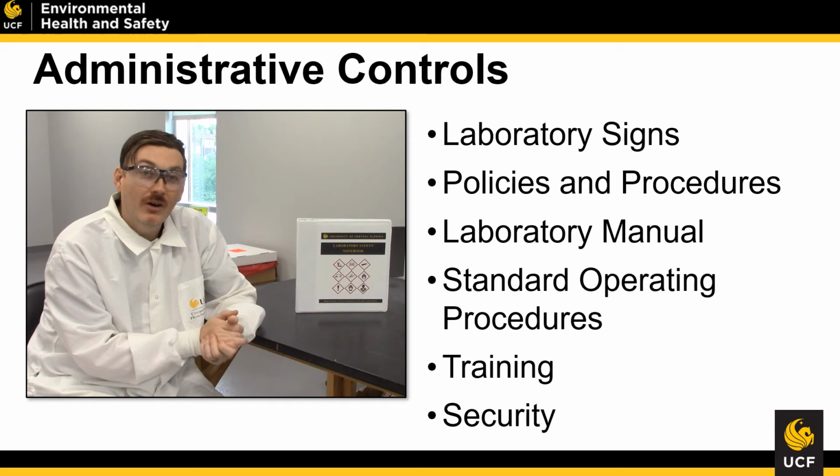Inspections will be done at a variety of different levels within your laboratory. Laboratory staff will have to take care of weekly and monthly inspections. The Environmental Health and Safety Department will come and do an audit once a year to make sure that larger scale regulatory compliance is being met.